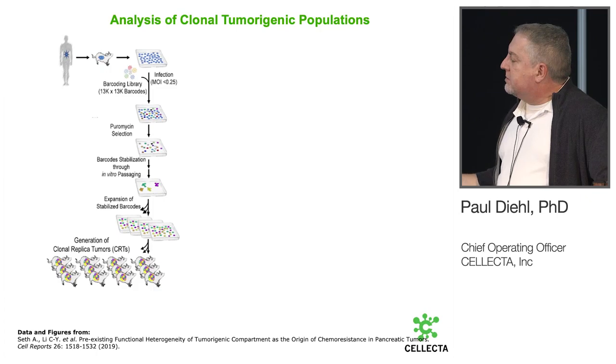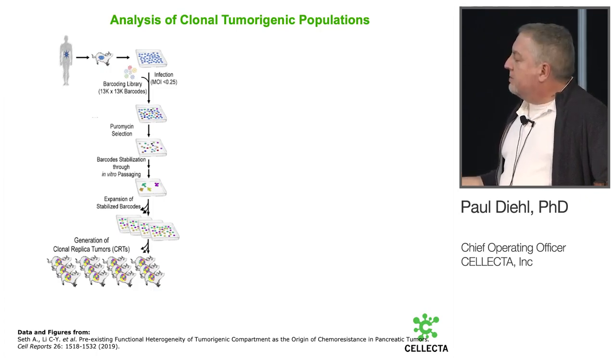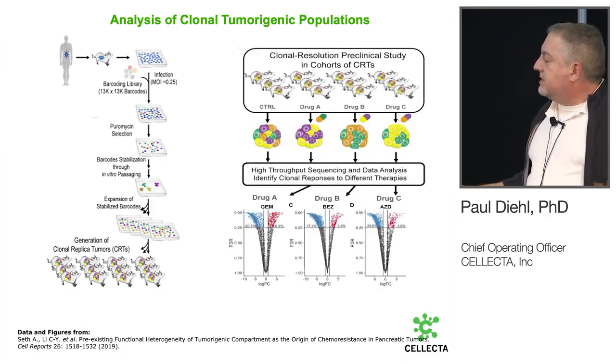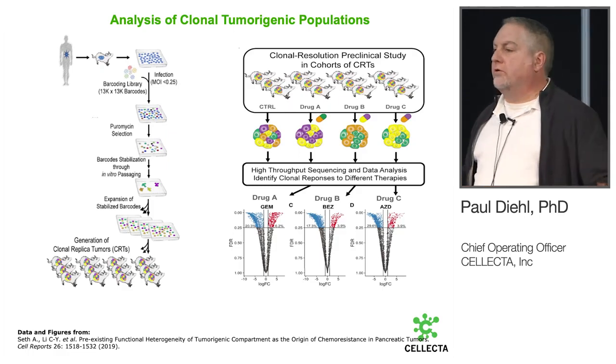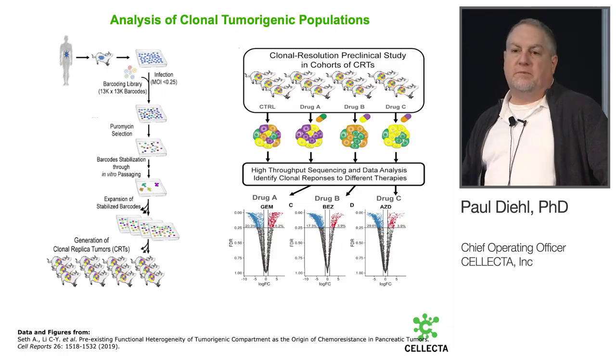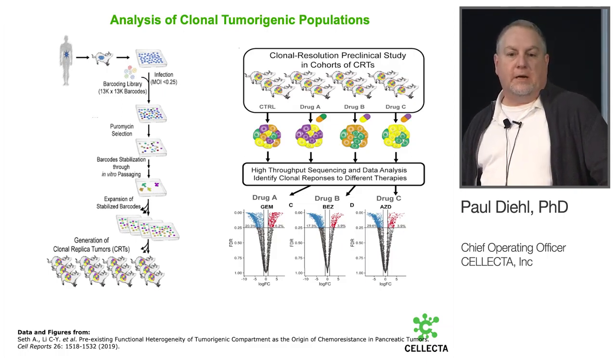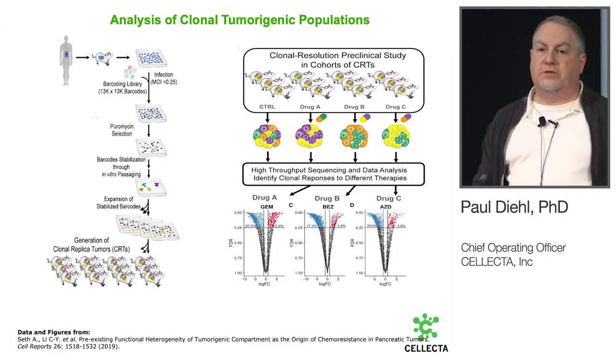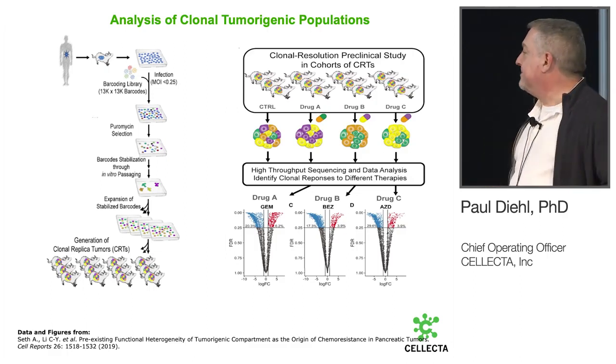And so using these tumor initiating cells, they were able to do some studies where they looked at how the population changes when they treat it with different drugs. They could find that, for example, the population obviously decreases and could be perturbed with certain drug treatments, but certain core groups of barcoded cells in this selected population came back regularly each time, and it was a different core group with different drugs, so they were able to actually look at that.